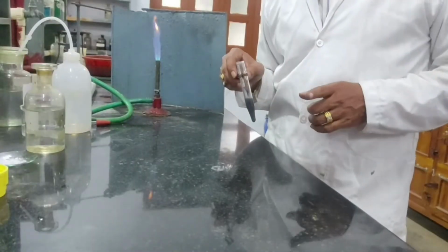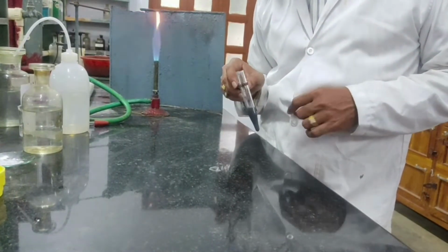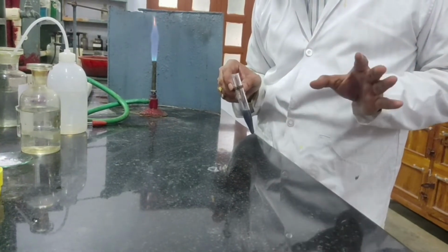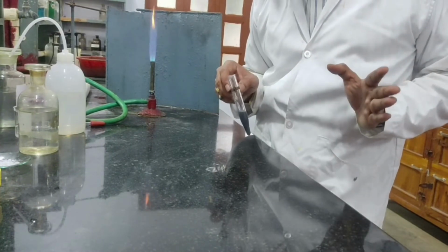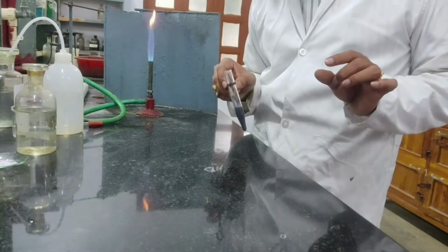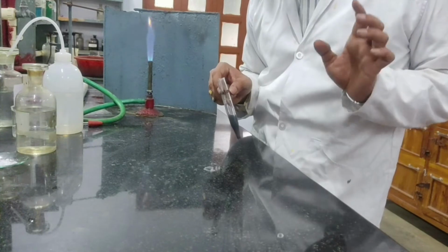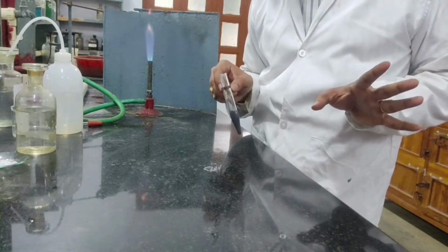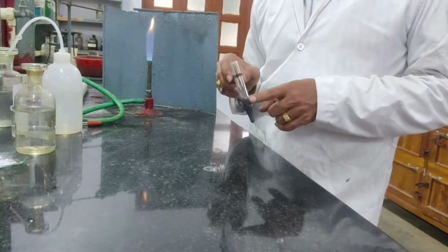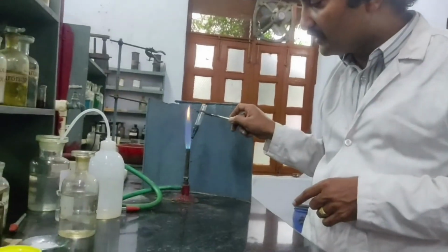Okay, that's it. This is the centrifugate I obtained after adding fourth group reagent to the given solution. I got a precipitate. I separated the residue. I have taken the centrifugate. I discarded the centrifugate. That residue is initially treated with a little amount of dilute HCl. I got a residue black in color and then I got a centrifugate. That centrifugate I am taking here. Okay. So this centrifugate is to be heated for expelling H2S gas.